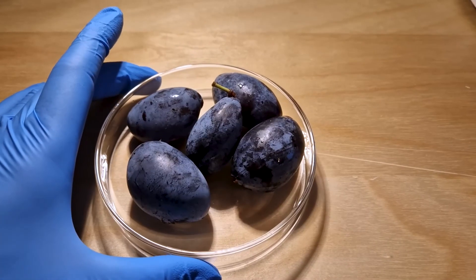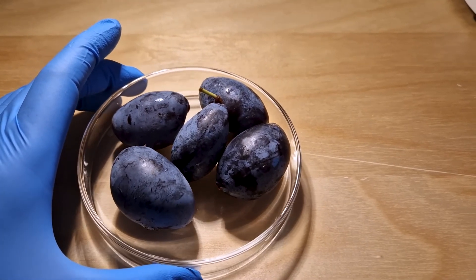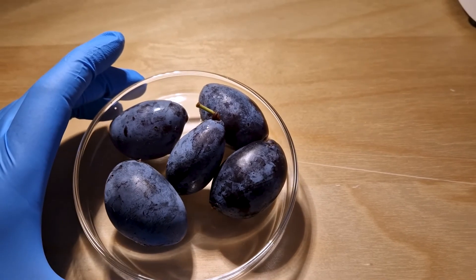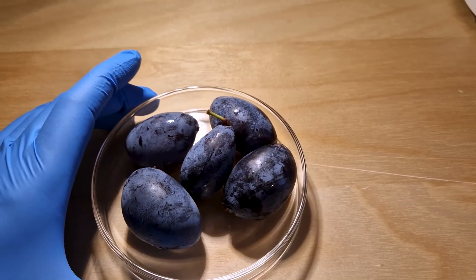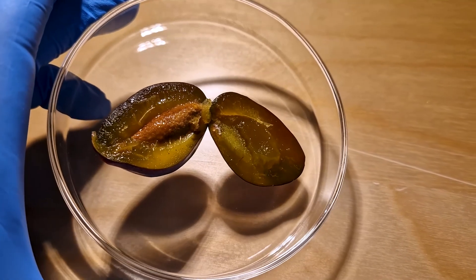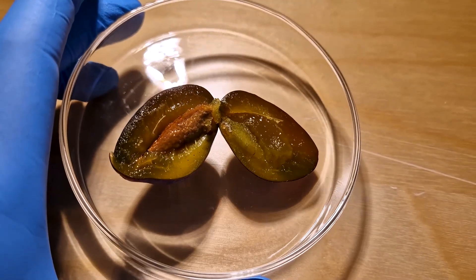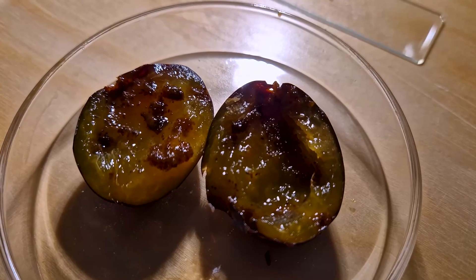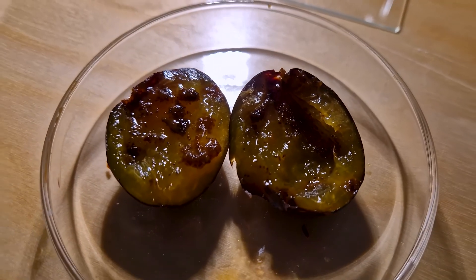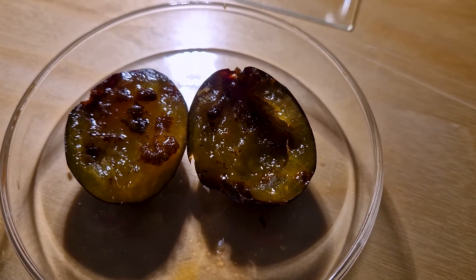The prune plum is a drupe and it has a more elongated and oval shape compared to the common plum. It is also less juicy. When sliced, a healthy, ripe and good tasting plum should look like this. Unfortunately, many of the plums I harvested looked like this inside. Not really appetizing.